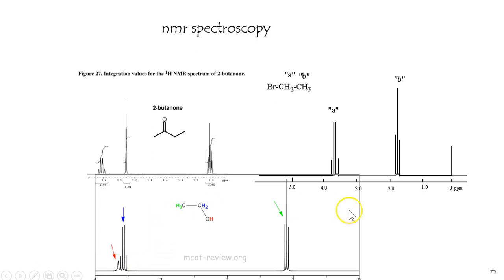And that is the NMR spectrum of ethanol. I recommend you only focus first on the area of the peak, which is easy. It's just the number of hydrogens. And then focus on the splitting, which is not that bad. It's neighboring hydrogens plus 1. Neither of these samples had neighboring hydrogens on both sides, but that's not uncommon. Simply add up the total plus 1, and you'll get the splitting pattern for those hydrogens. That's NMR spectroscopy, a brief introduction.